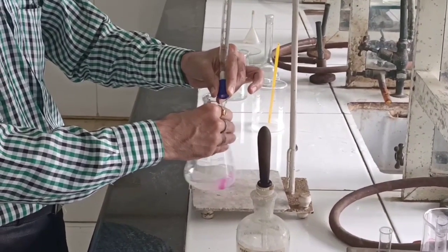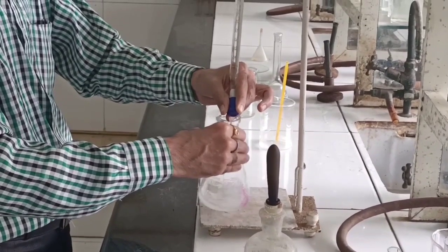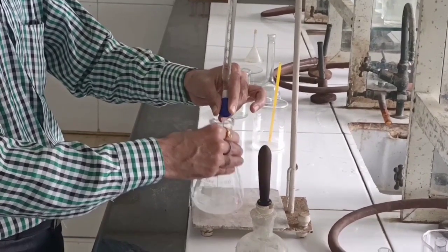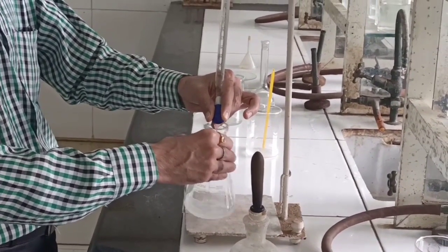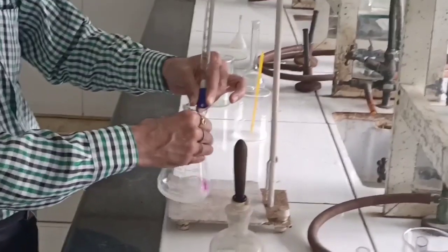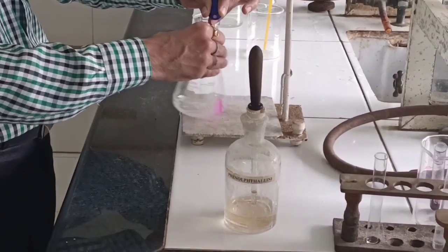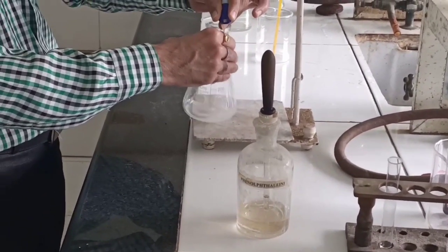So very slowly, drop by drop, we are going to make sure that the addition takes place and the conical flask has to be continuously stirred, so that you can see the pink color develop at the point of contact, but then on shaking the conical flask, it disappears. So we need to continue till the permanent pink color.